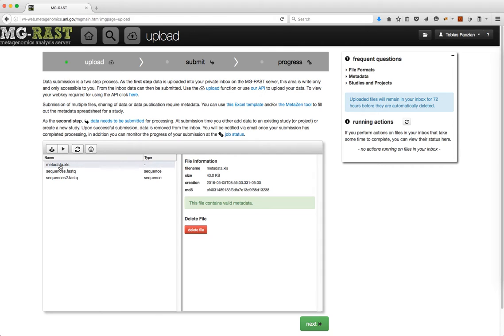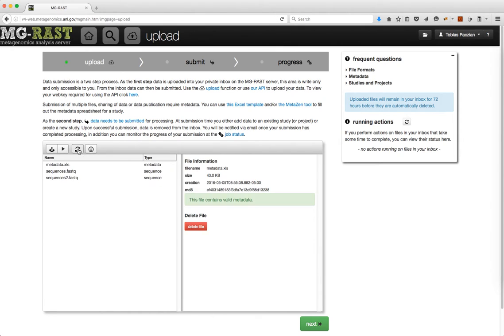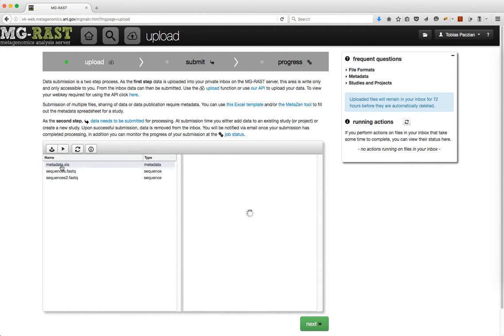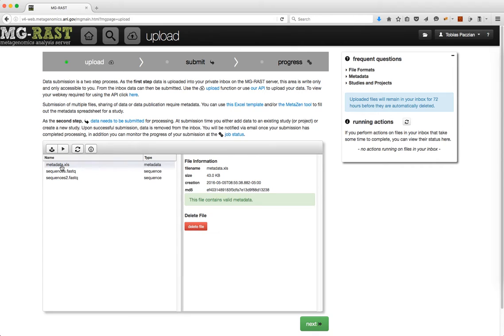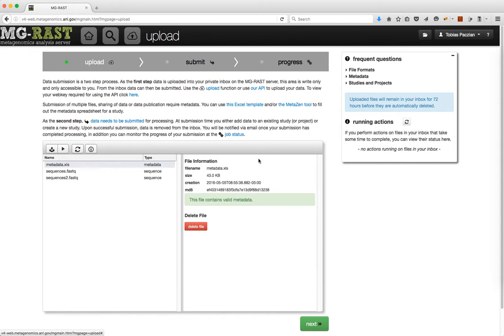Click the refresh button to update the information about your inbox files at any point. Having both sequence and metadata ready, you can continue to the submission page by either clicking in the top bar or the next button.